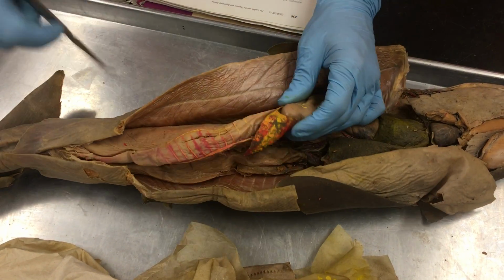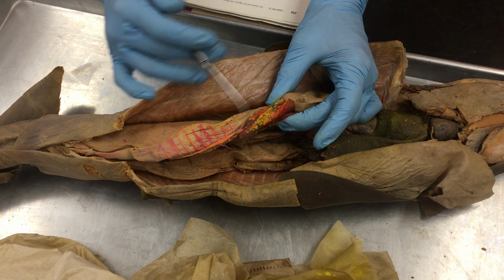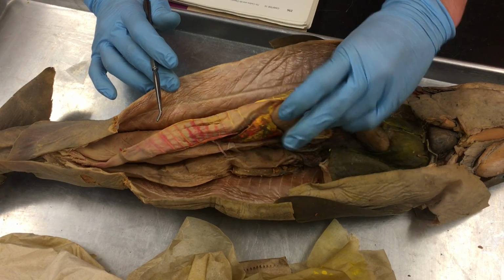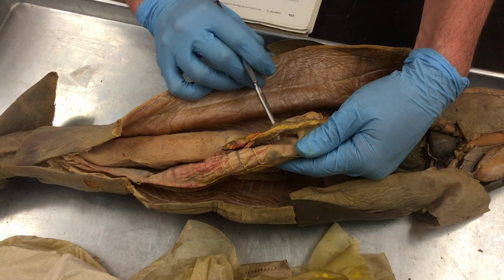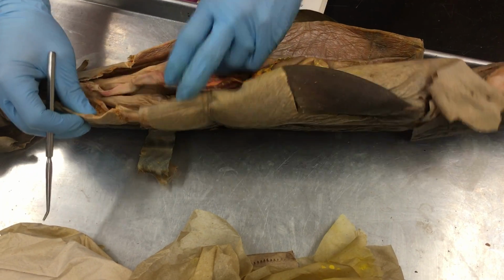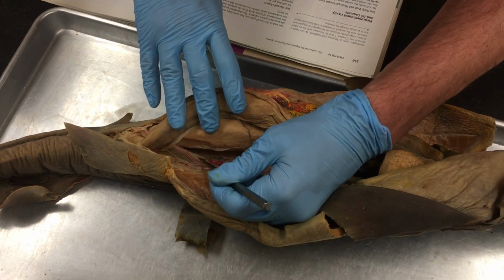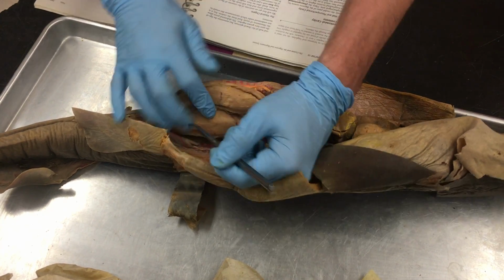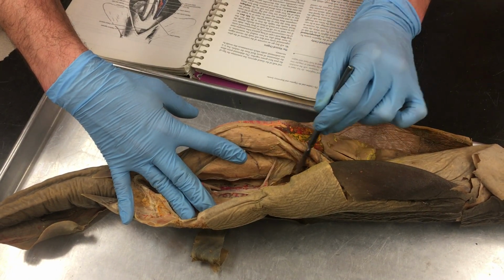The spleen is here. The triangular lobe-shaped thing. Pancreas. If we flip the stomach like that, pancreas is here. The digitiform gland is this little finger-like projection here. Kidneys are the dark regions along the dorsal body wall.